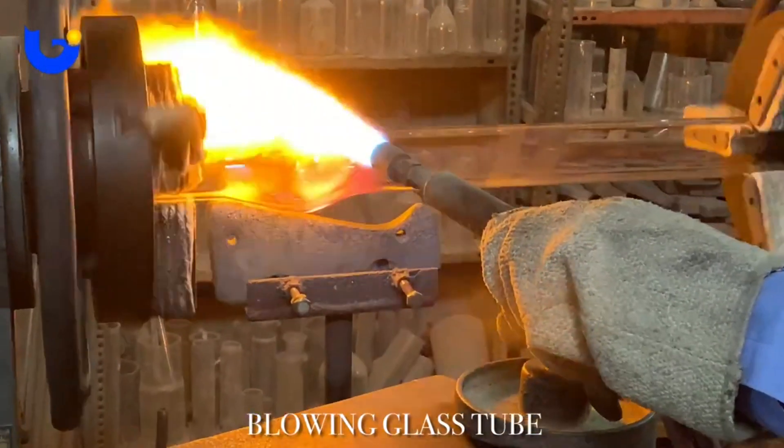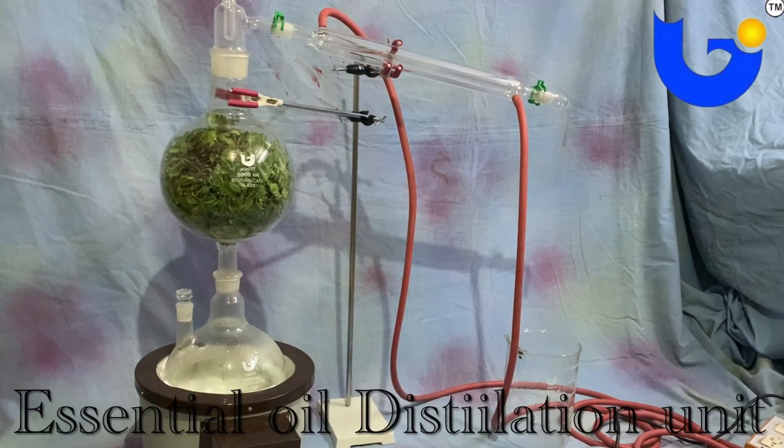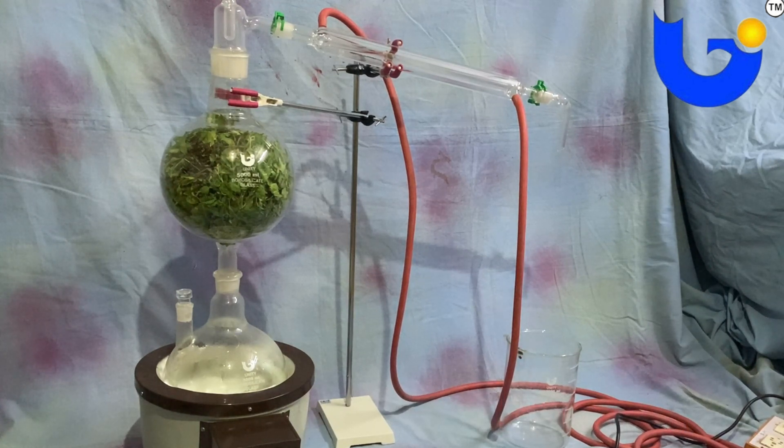In this video, we are sharing information about distillation units, particularly essential oil distillation units which are used to extract oils from natural plant-based raw materials.